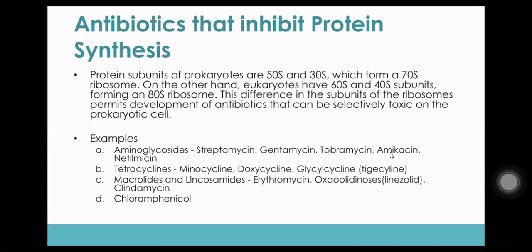So chloramphenicol is effective against a wide variety of gram-positive and gram-negative microorganisms. And then you add also fusidic acid. Okay, fusidic acid, F-U-S-I-D-I-C acid.